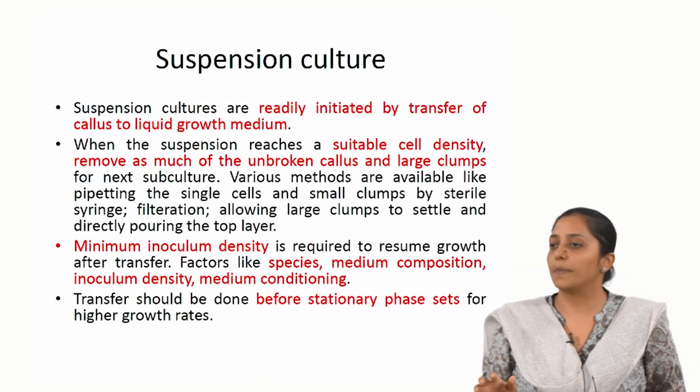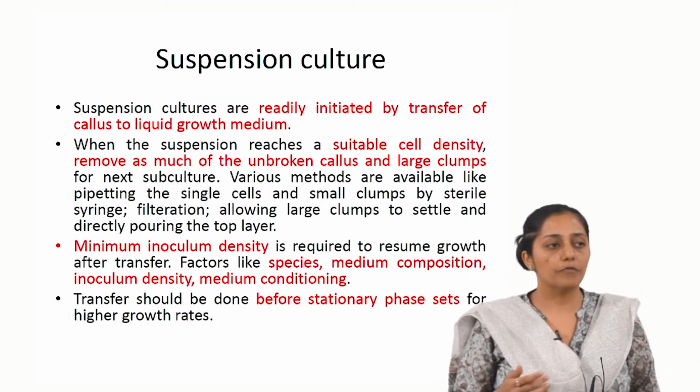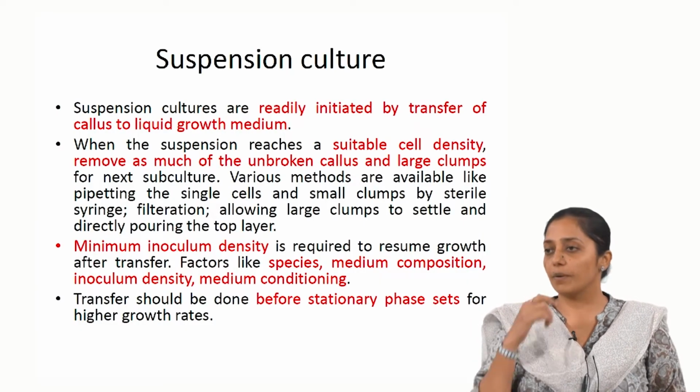Now, coming to the suspension culture. So, now how is suspension culture induced from callus?